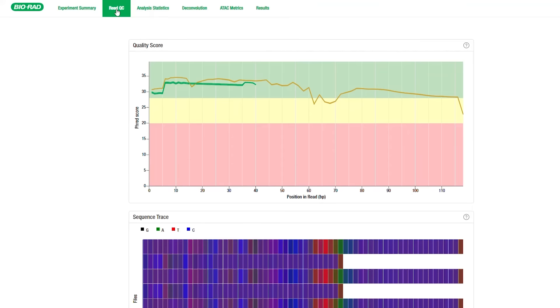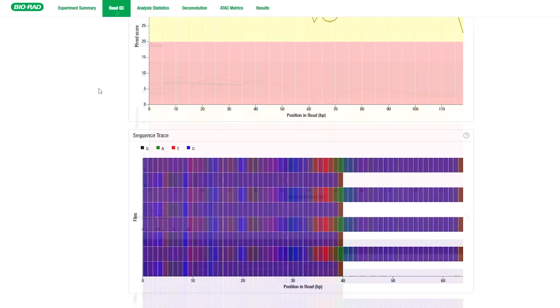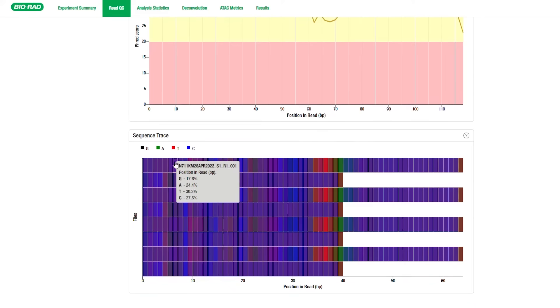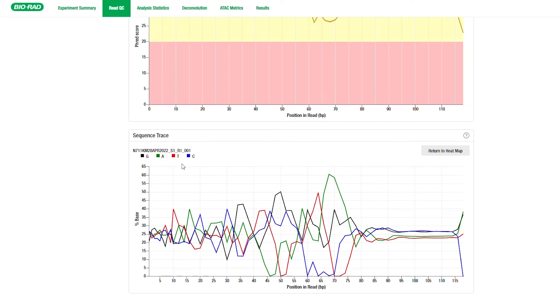The ReadQC tab shows the mean PHRED quality score at each base position as a measure of base quality in sequencing. Below that is the Sequence Trace Heat Map, showing the proportion of each of the four DNA bases being called at each position. You can click on one of the READ positions for either READ 1 or READ 2 to switch to the Sequence Trace Plot view. This provides another way to view the mean nucleotide composition at each base position.